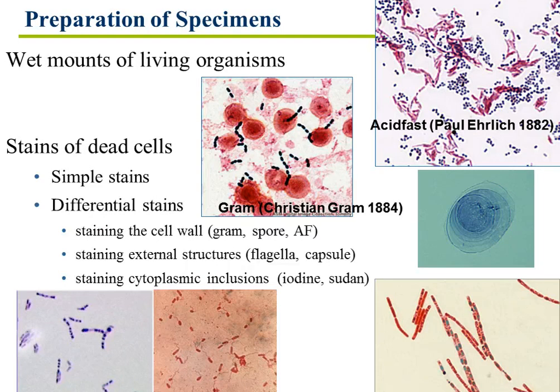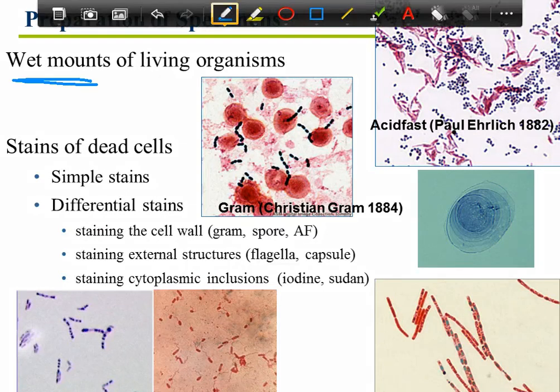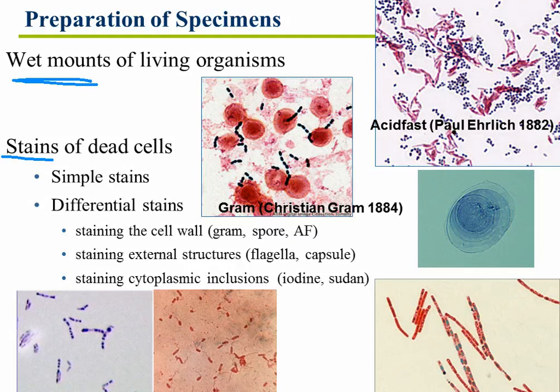Okay, so you can look at things as a wet mount, and you can look at things as a stain. Depends on what your aim is. If you just want to see them, see if they're bacteria in blood, you want to do quantitative counts, you want to see shapes, you want to see tiny little microorganisms, then you're going to be doing staining. Bacteria are too small to look at effectively on wet mounts. Now we do it one time this semester, and after that you'll really get to appreciate staining, because staining gives you much better elucidation of bacteria.